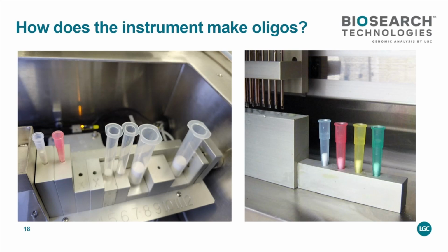The reason is so the reagent has time to penetrate those little grooves and time to react. If you just put it in there and flush it, you will never have an oligo. So the instrument programming allows you to set the specific time of contact inside the column. Also, you put a lot of solvent in there, and it's slowly moving through, exposing the CPG to fresh reagent.